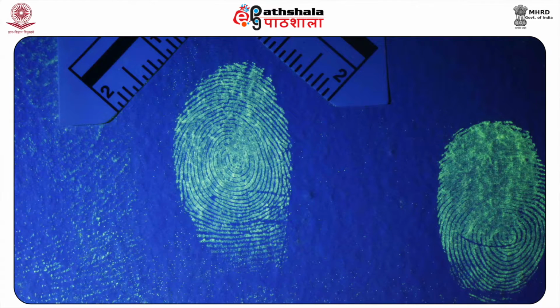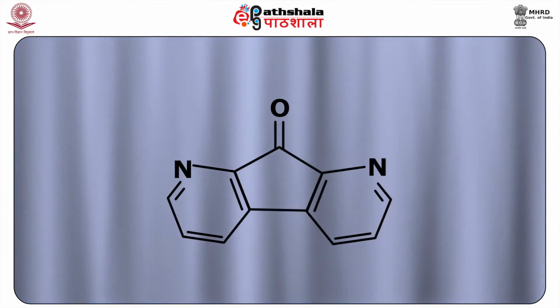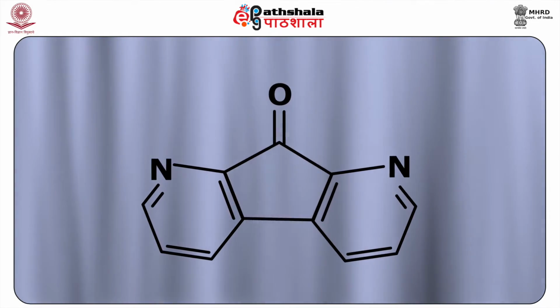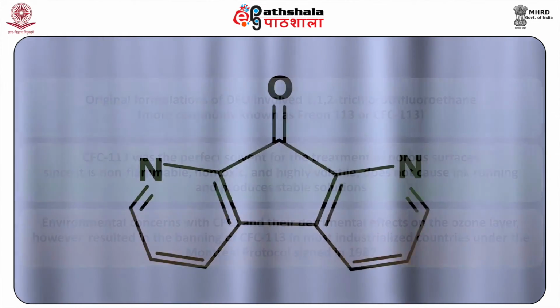As a result, reagents which give colored derivatives on interaction with amino acids render visibility to both fresh and old fingerprints on a wide array of surfaces. It is therefore not surprising that amino acid specific reagents have been used in several casework investigations. One such reagent is 1,8-diazafluoren-9-one, abbreviated as DFO.